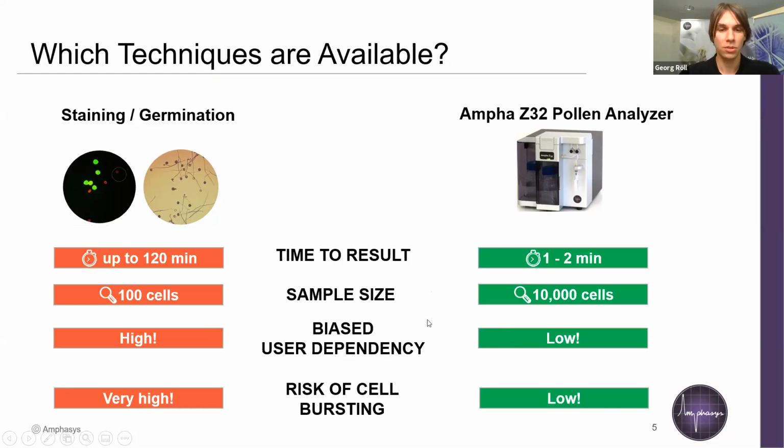And I showed you the video before of the bursting of wheat pollen. If we are focusing on bursting, the risk is very high with the staining and germination methods. With our technique, because it goes really fast, it's way lower.